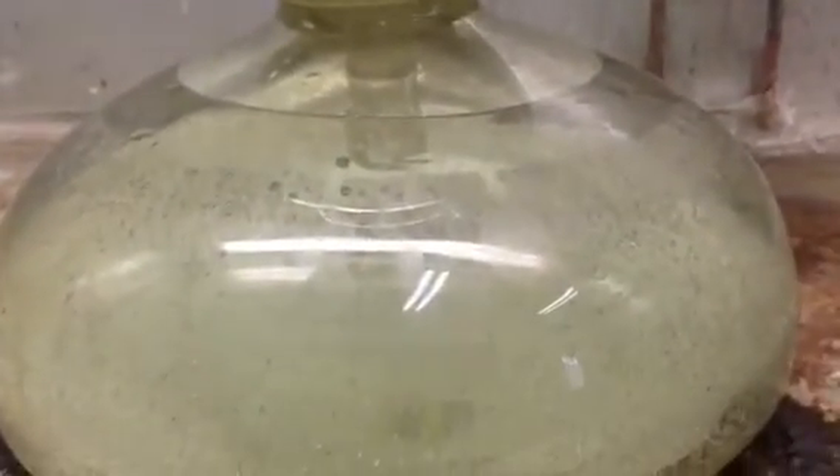Fluid can move up from the bottom reservoir into the top where it contacts your medium. In this case I have some marble — calcium carbonate — in there, and the reactant is a dilute solution of hydrochloric acid and water.